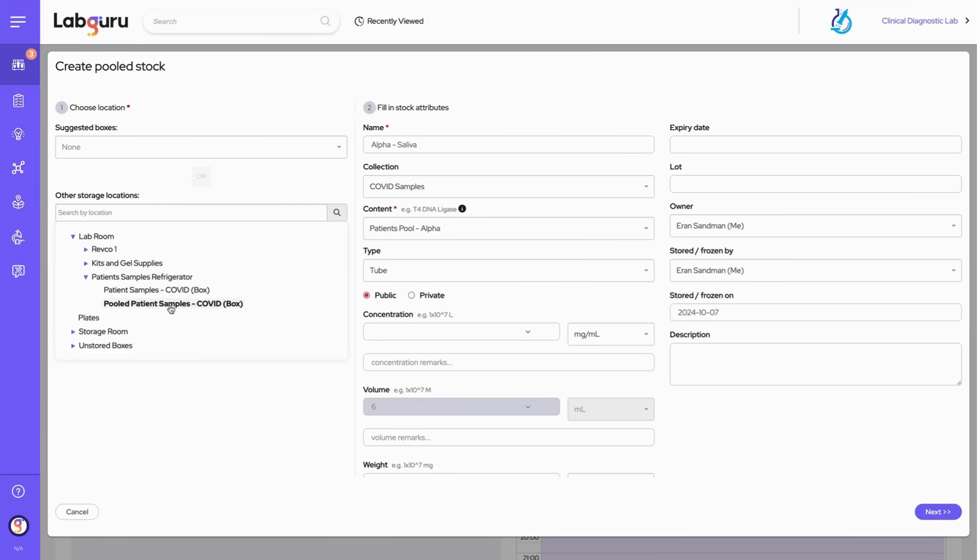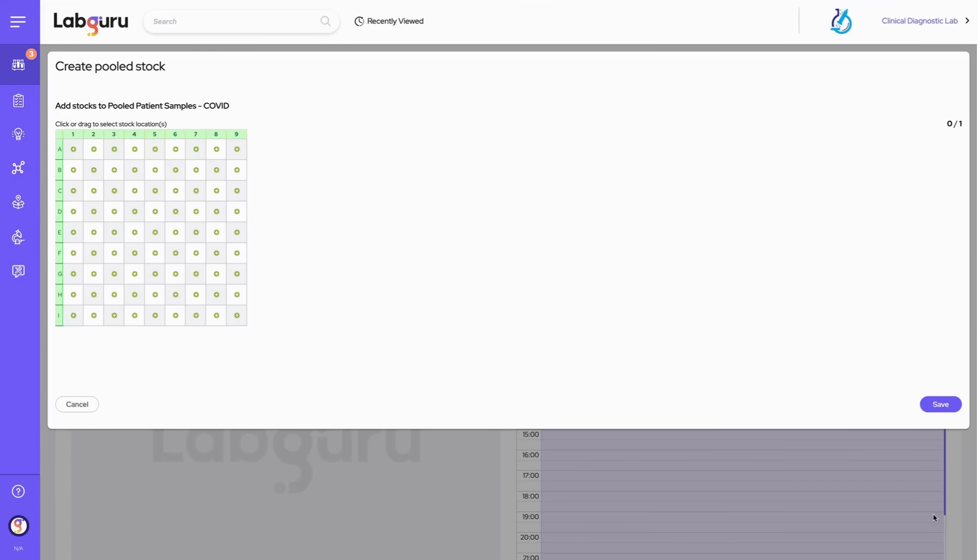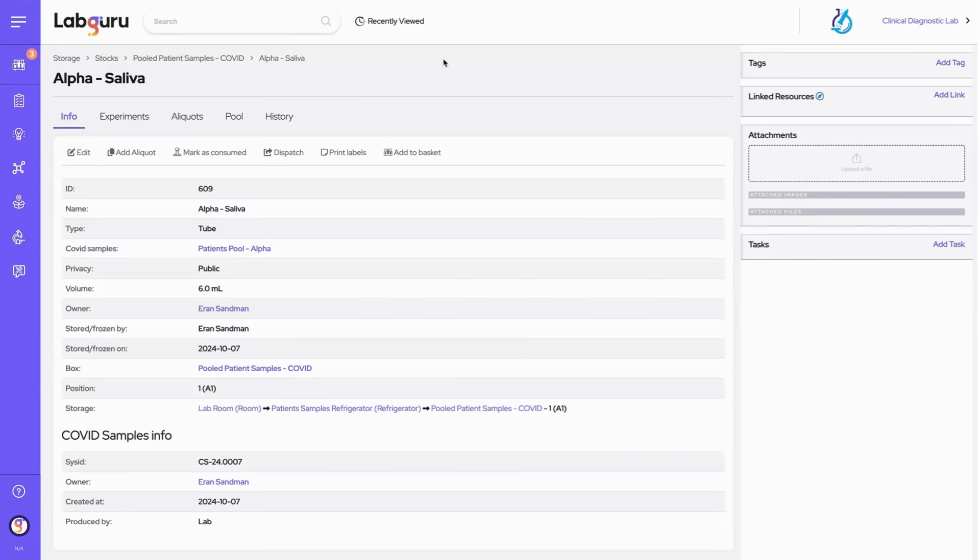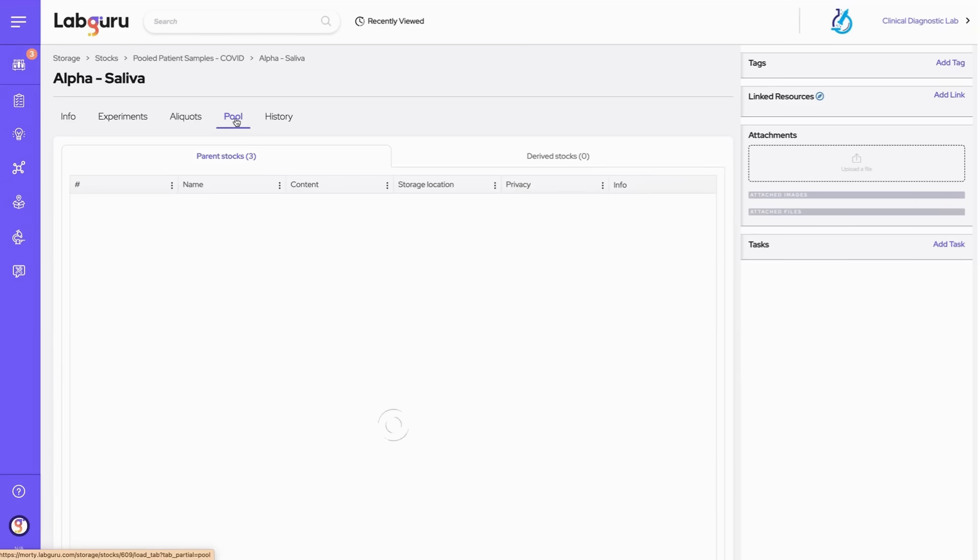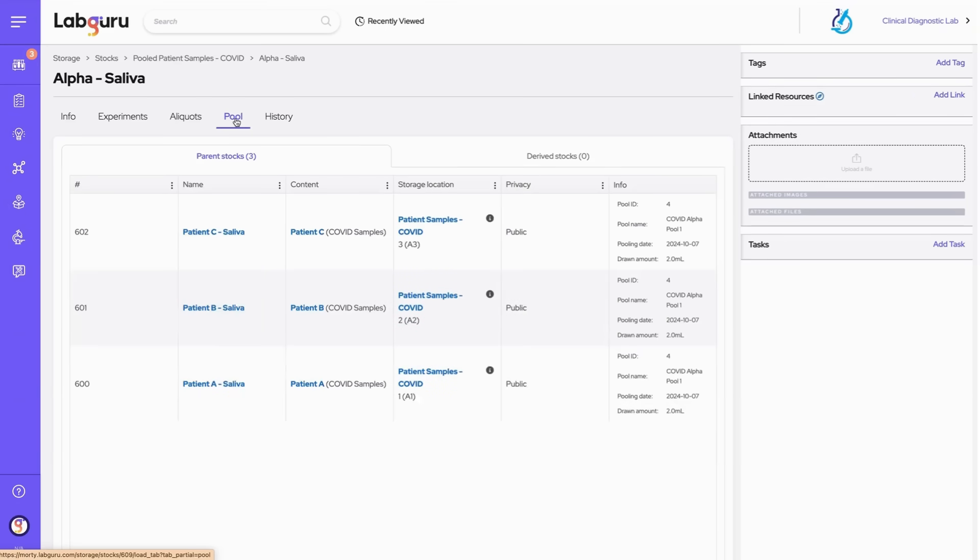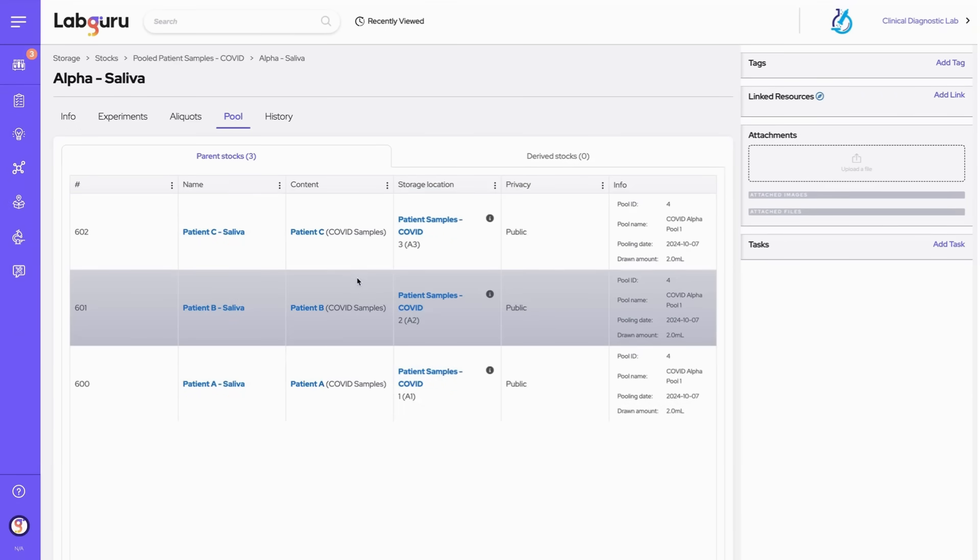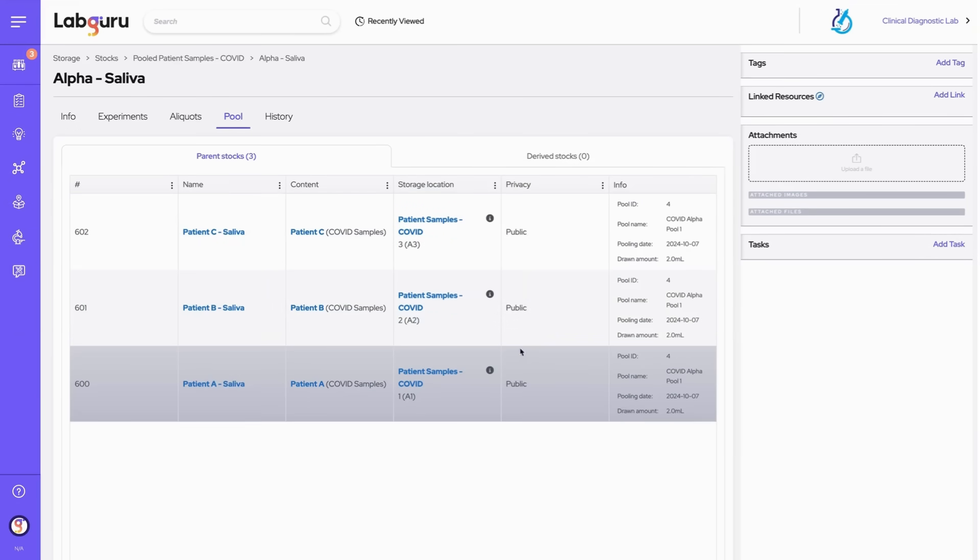For our newly created pooled sample, we'll navigate to its show page to dive into more details. In the pool tab, we can explore the connections to parent stocks and derived stocks, providing a full view of its lifecycle.